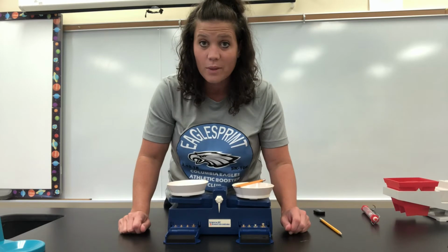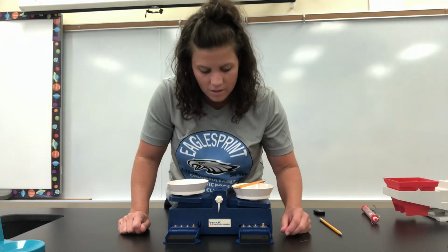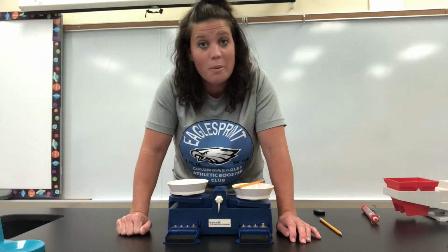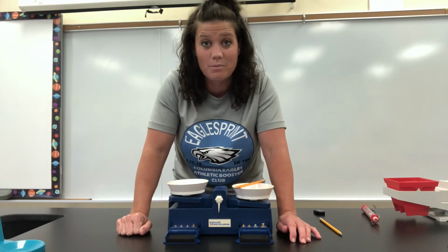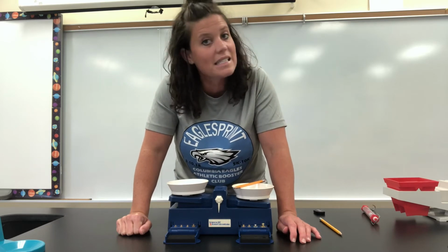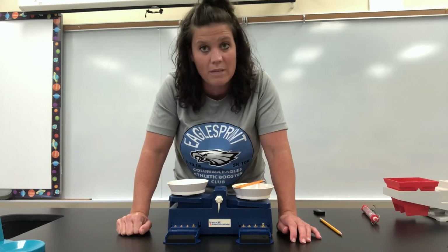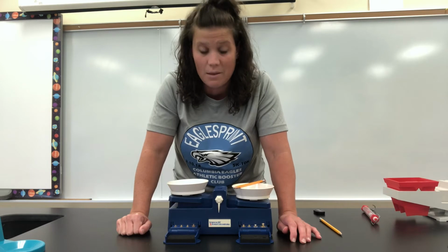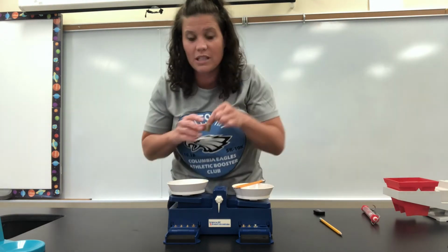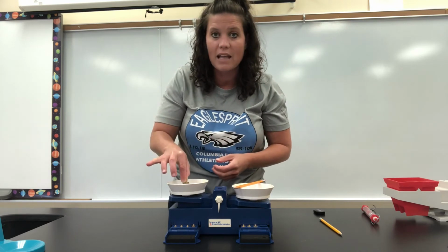We could also put that object on the other side to try to balance it out, or we can drop down the fronts here and we have little gram weights, okay? So grams are what we use to measure mass. Grams, kilograms, okay? Not pounds. We're not going to use the customary measurements. In science, we're going to use the metric measurements. So for mass, that is grams. All right, so these little grams are little weights. We're going to put these weights on the other side to try to balance it out.